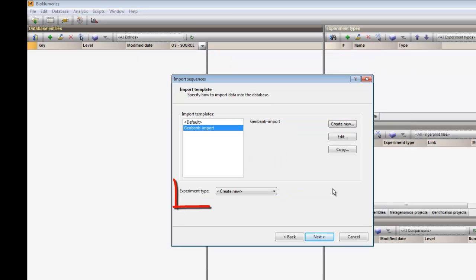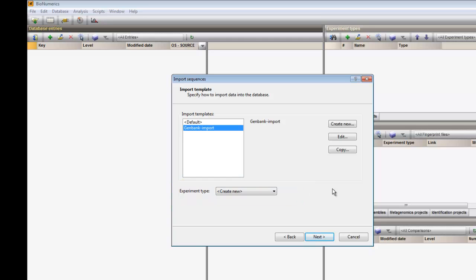I can choose a sequence experiment that is already present in my database. Or, in case it is the first time that I import sequences from this specific gene in this database, I can create a new sequence experiment type. I will create a new sequence experiment and I am prompted to give it a name.